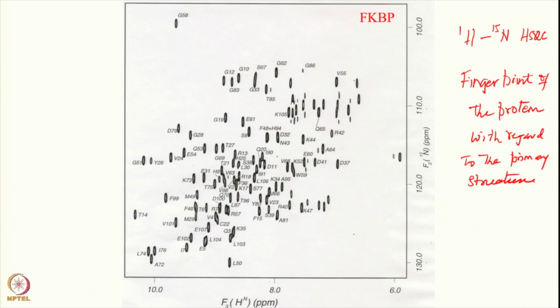Therefore, you also make use of this to find out the status of the protein in your solution. And then of course you have to devise conditions to break these aggregates and get single molecules. This is an extremely useful technique, and we will show you how this has been used to identify or determine the folding pathways or aggregation pathways in proteins. This has also been a very useful procedure for this.